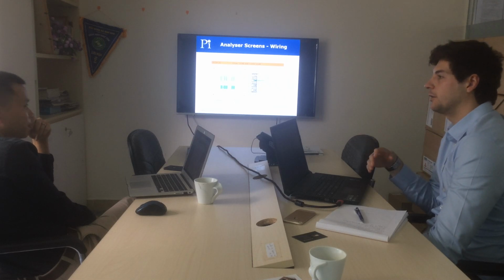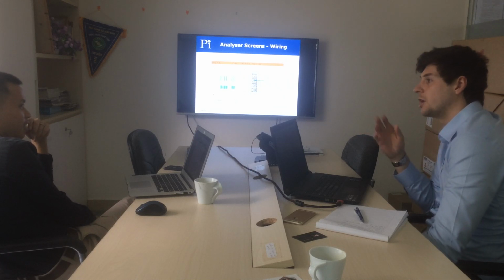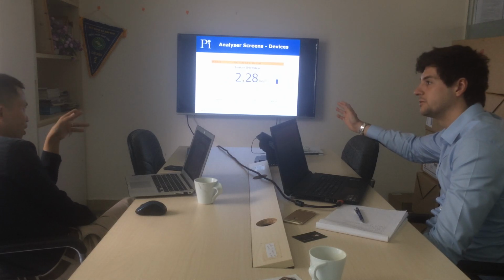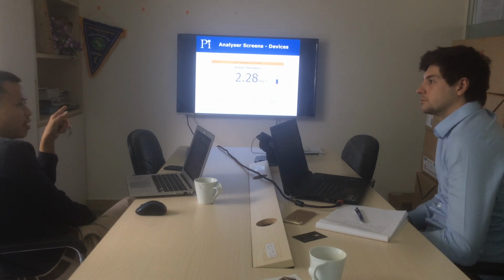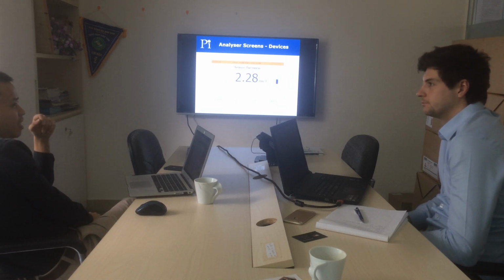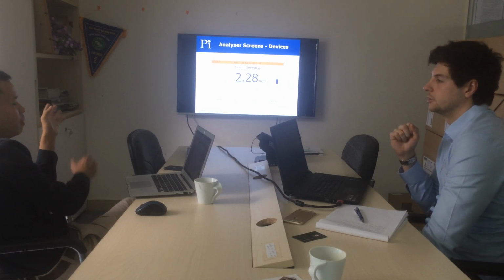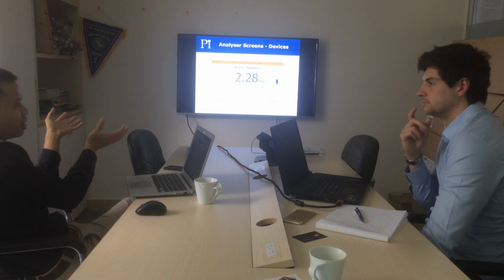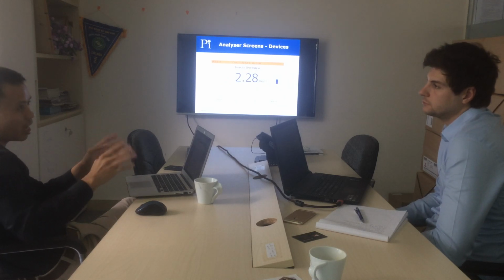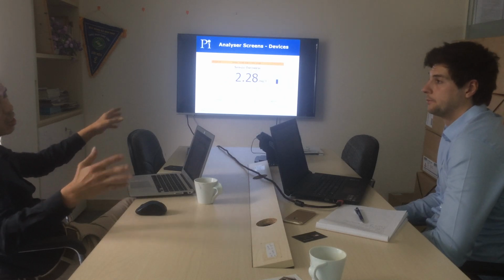When you're asking about differentiation, maybe Endress+Hauser do this, but a lot of other companies don't provide this information. Normally, the one disadvantage of Endress+Hauser is that they just accept sensors from their brand with the analyzer. They do not accept a sensor from another brand. Sure, because maybe they are a big company, so they have enough range of sensors. With the pH sensor, maybe you have a small range, so maybe you should accept sensors from another brand.